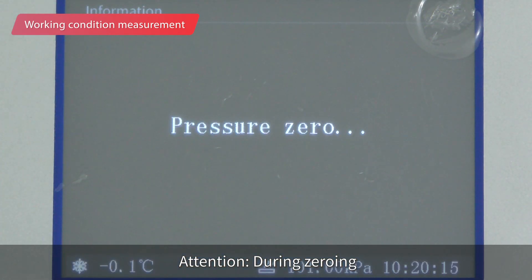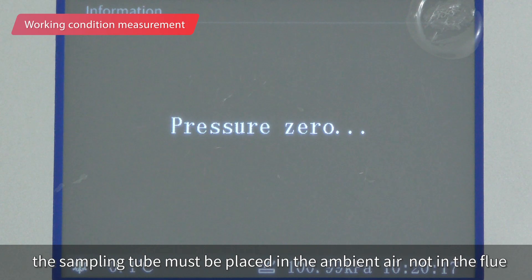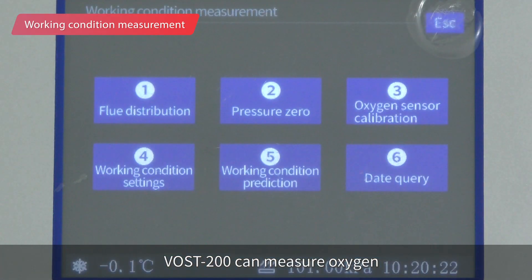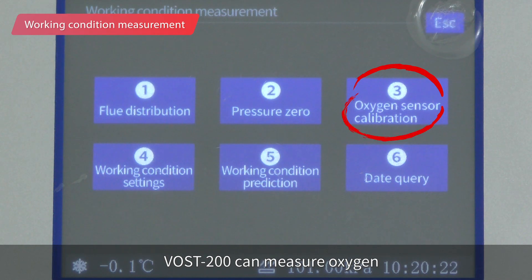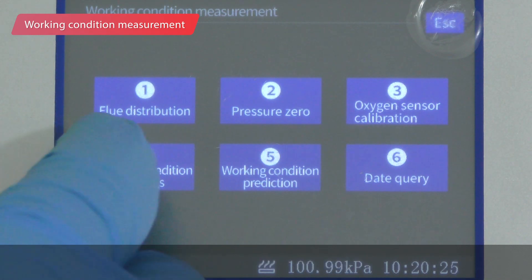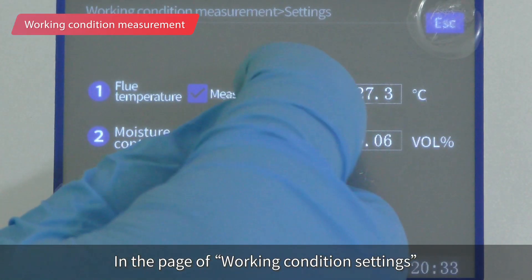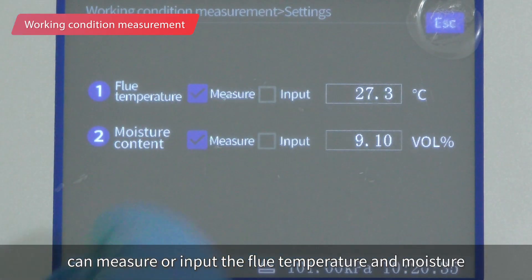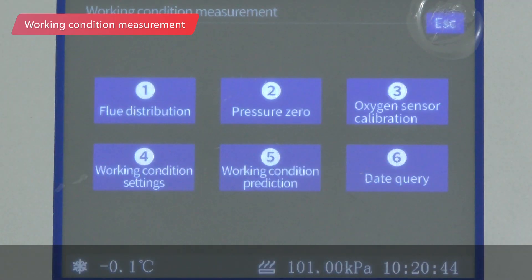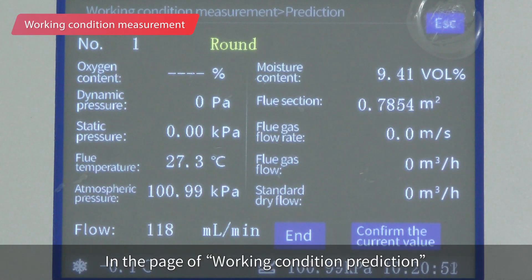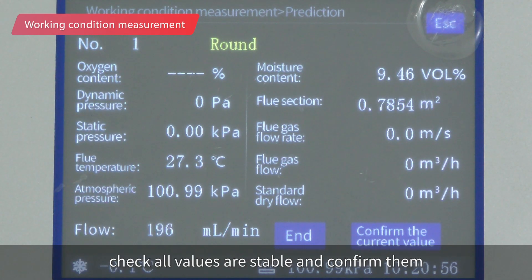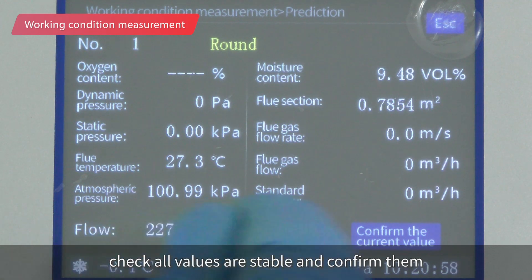Attention: during zeroing, the sampling tube must be placed in ambient air, not in the flue. The VOST-200 can also measure oxygen — this is an optional function, not demonstrated here. In the working condition settings page, you can measure or input the flue temperature and moisture. In the working condition prediction page, place the pitot tube at the first point and check that all values are stable, then confirm them.